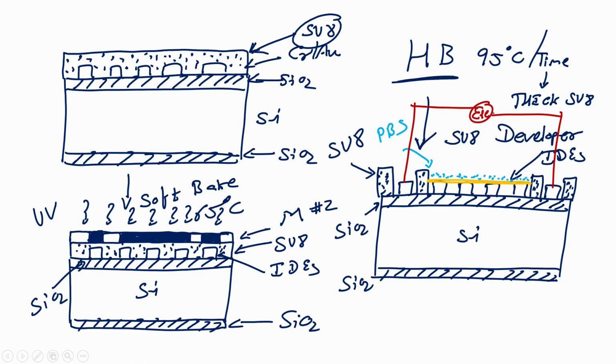I can measure the electrical property. Now, if you understand in detail the difference between resistance and impedance, you will say that we should measure impedance because there is a parasitic capacitance, also a double layer capacitance, and other parameters that come into effect. So, we cannot rely on resistance, we should rely on impedance measurement. And thus, when you place different tissues over the interdigitated electrodes, you will see that the impedance of the tissue changes as cancer progresses.